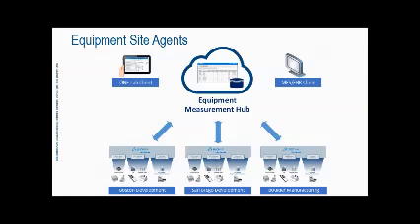The last thing I want to mention is, in addition to all of that, you might be thinking, how do I make this all work across the globe? I want to run this holistically, and I want to make this work not only in my research lab or my development lab, but I also want it to work in manufacturing. So we've been working really hard with help from Amgen and others to try to create a distributed data acquisition environment where we can have all of the equipment connected in Boston and all of the equipment connected in San Diego. And potentially even, so these are development sites, this is a manufacturing site. We're going to pull all that data into the cloud and then be able to bring it into one lab with a one lab client or potentially even an EBR client where they're both accessing the same cloud environment and pulling data out. There's a lot of really cool advantages of doing that.